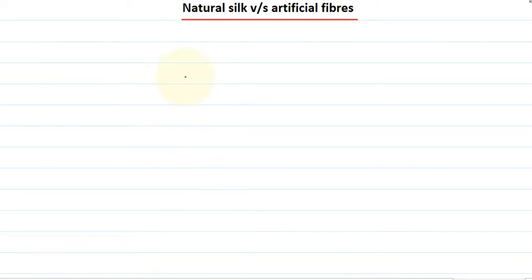The topic for today's video is natural silk versus artificial fibers. So today we will perform an experiment and see how we can differentiate between natural silk and other artificial fibers.